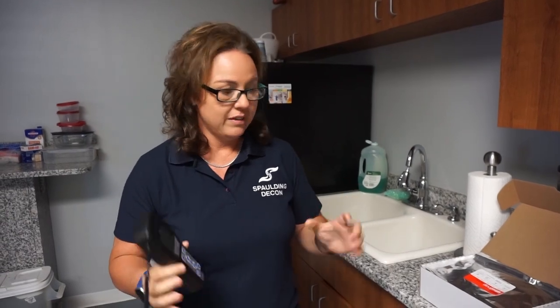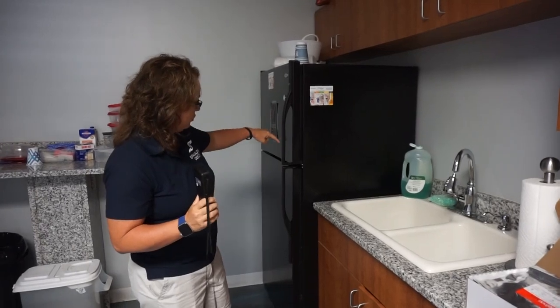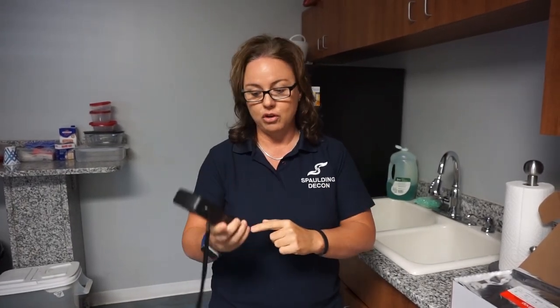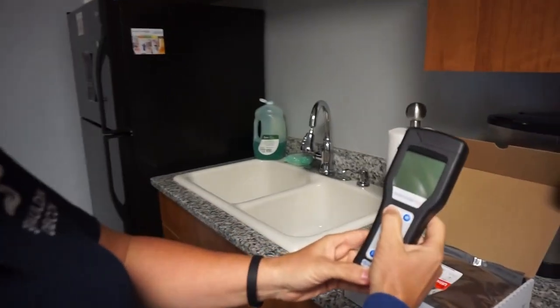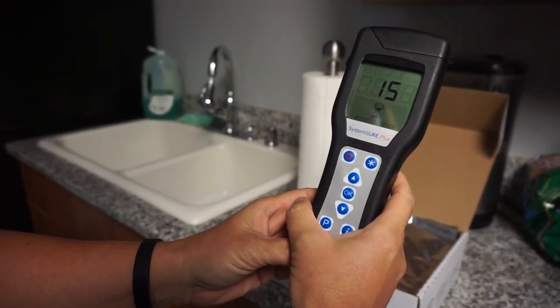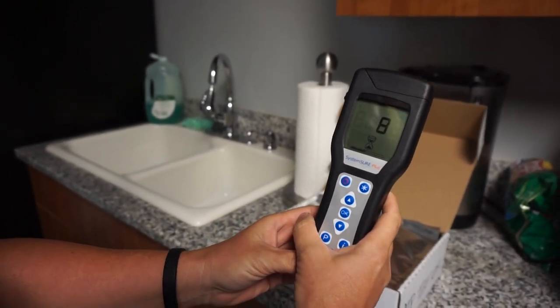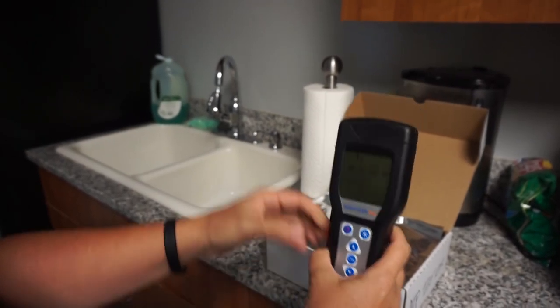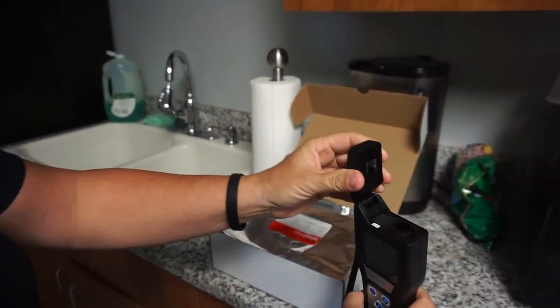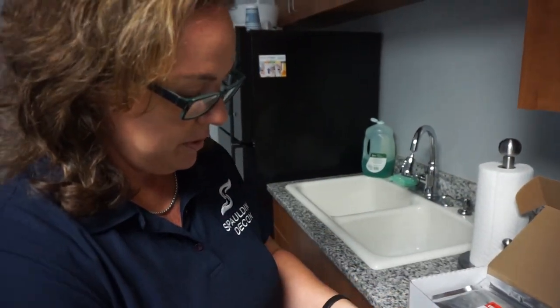Our kitchen has not been cleaned, so I'm going to test the handle here uncleaned, and then I'm going to take some Shockwave and clean it and see where the counts go. The first thing we're going to do is turn this on — it takes about 15 seconds to get set up and calibrate. Okay, so it's ready. I'll open it up here and lay this down.